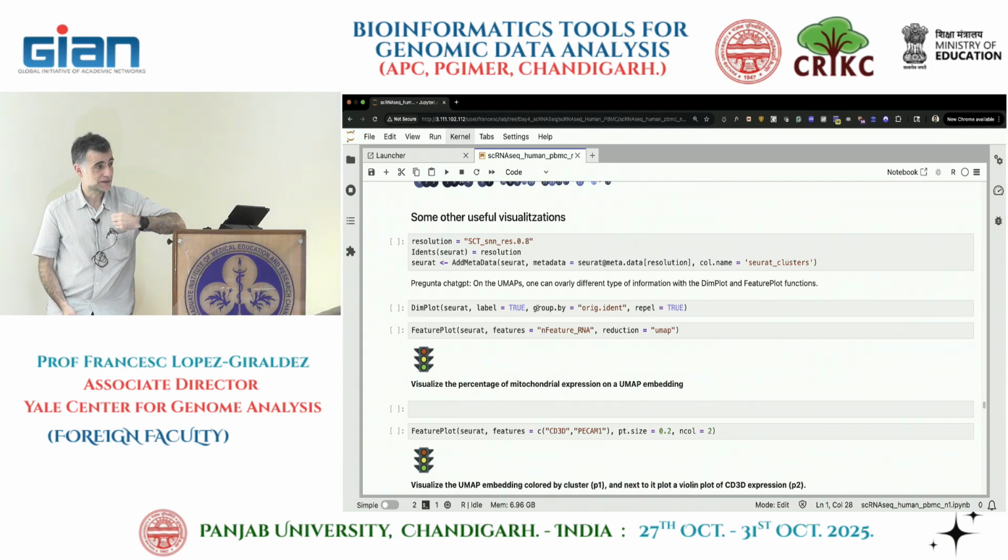Another thing, cell types are also artificially created by us, right? Biology is not saying, oh, I'm a cell type, right? Of course, it has a meaning, biology. Okay, we create groups. We need to create identities to be able to work with them. That's an important message. So that's something that I always try to convey to people that look at our analysis.